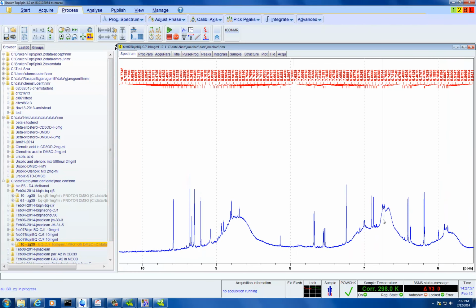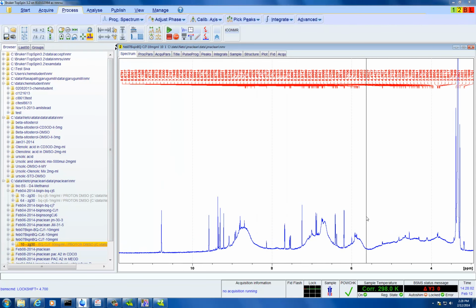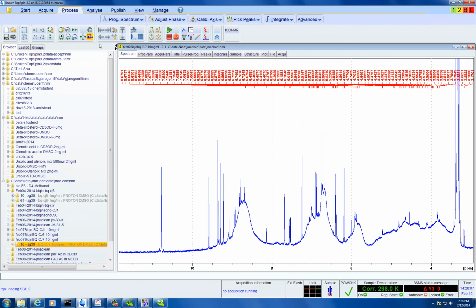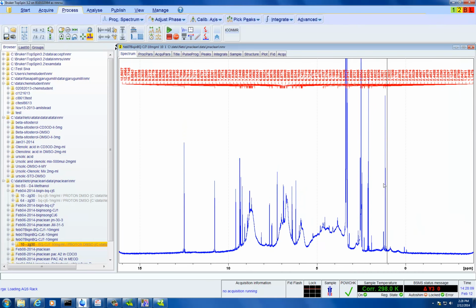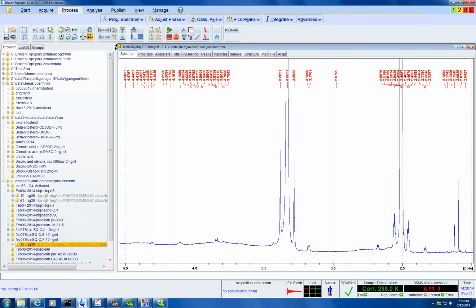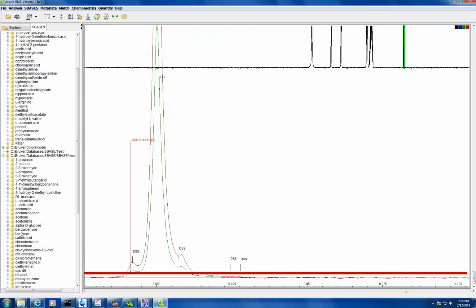Anything here you can quantify, no problem. Okay, but we want to identify it and then quantify it. So it means we need the standard compounds? You would need to know what that compound is, because without information from the NMR, it won't know that this area here is PAX or whatever it is. You need to tell it. That's why you have the spectra base.